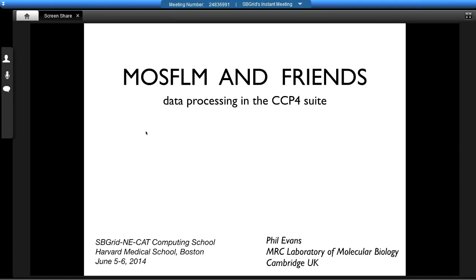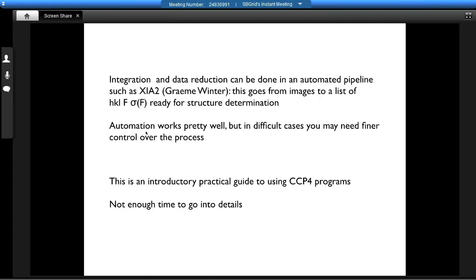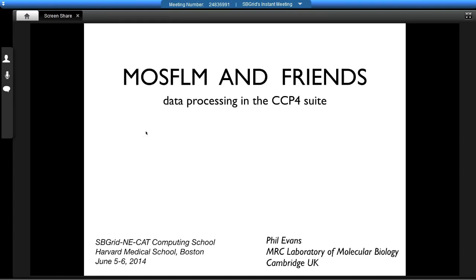But I think most of you know that Phil is one of the founders of CCP4, worked in data collection and processing, and today he's mostly going to talk about scaling of data. And I'm talking about MOSFLM as well. Excellent, thank you very much. So, MOSFLM, scaling, Aimless, he already participated in the panel. A general, all-around good guy.